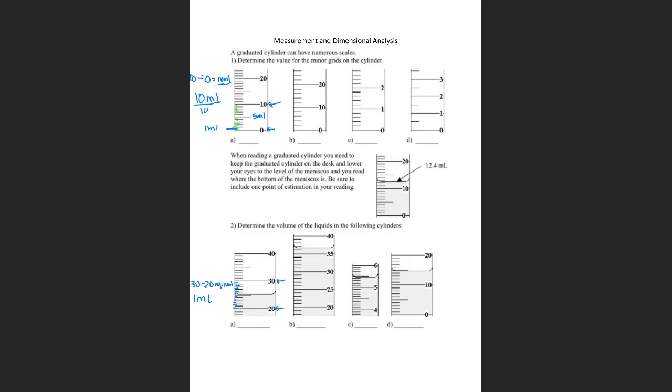It's okay. So that means that right here, halfway between these two is actually 25 milliliters, right? But they want you to read the actual value of this meniscus. When the liquid is bending on that mark, they want you to read the actual value. So for that part, I have to zoom in even further. Okay, so I'm zooming in further so I can see.